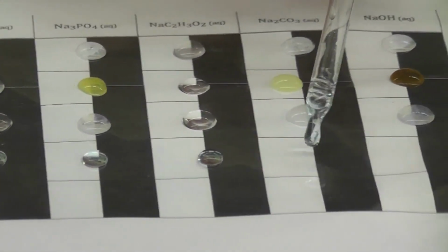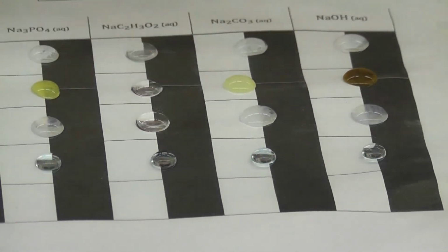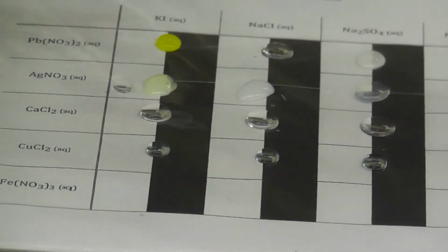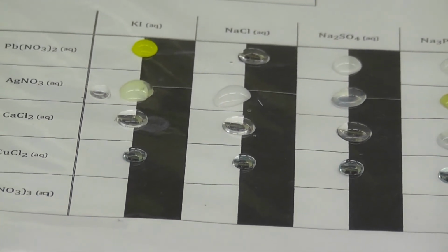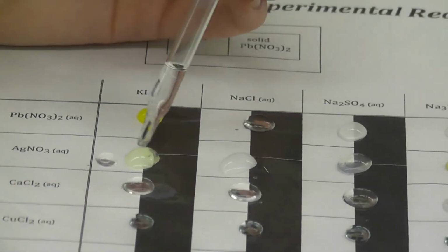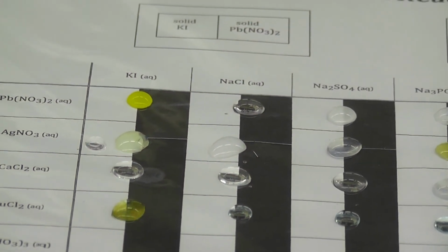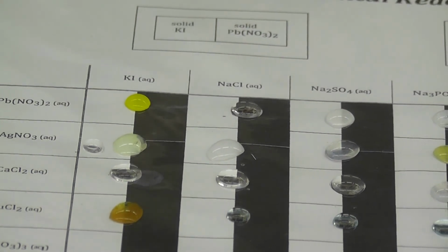Drop, and last drop. Okay, it already has kind of a blue tint. So now we're going to do the corresponding top values, or top solutions. Okay, first is the potassium iodide with the copper 2 chloride. It's 1 drop potassium iodide. Ooh, so it took a second. So observe that reaction.